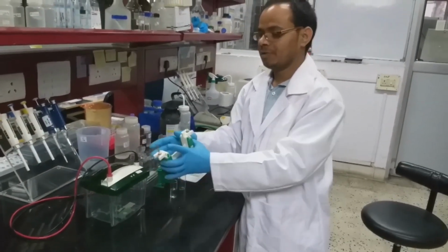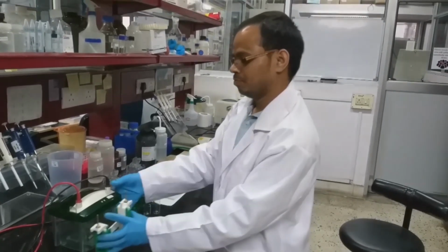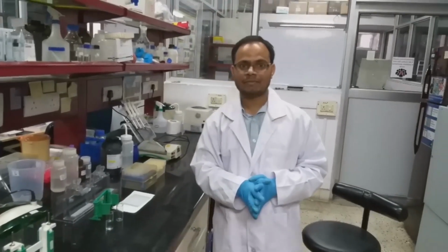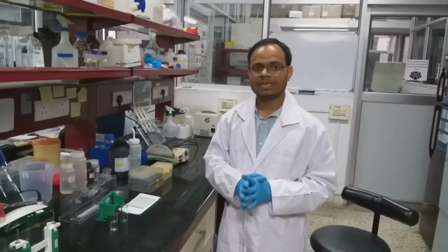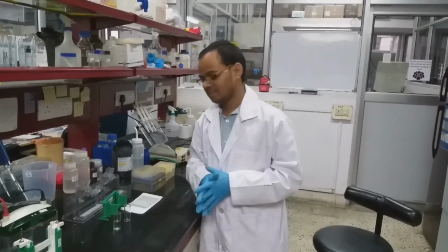Then we will connect to the power pack and run the gel. So this is the overall introduction of how to prepare an SDS based gel. So let's start preparing the gel. We will learn more things while preparing the gel.